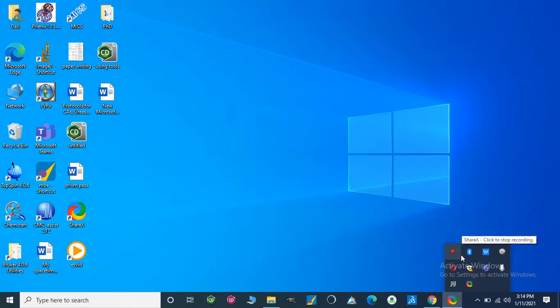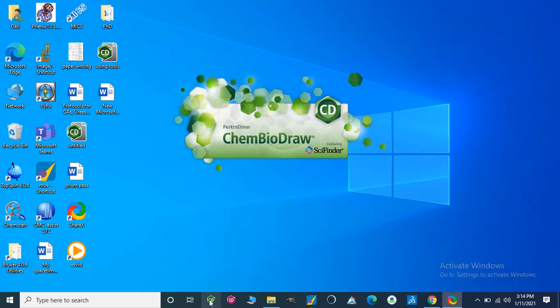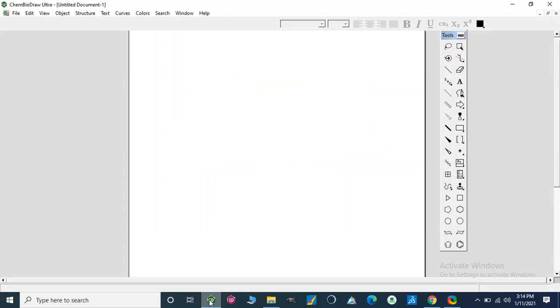Dear viewers, in this video we are going to learn some interesting features of ChemDraw which are mostly related to biochemistry. As we are moving towards docking studies, I would like to introduce it and meanwhile we will learn some other features of ChemDraw.